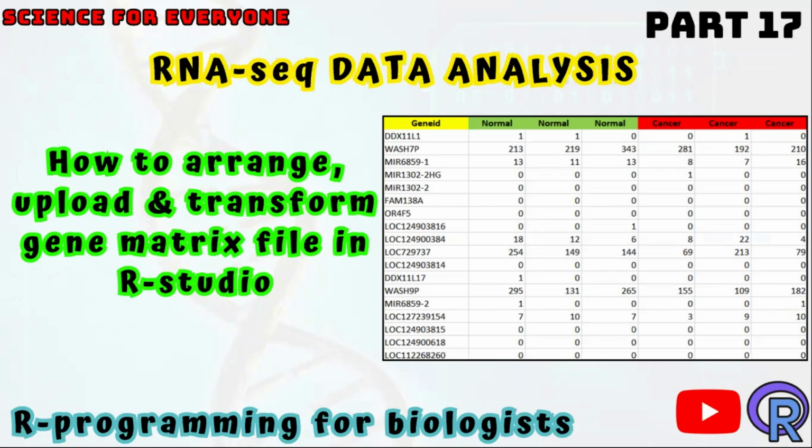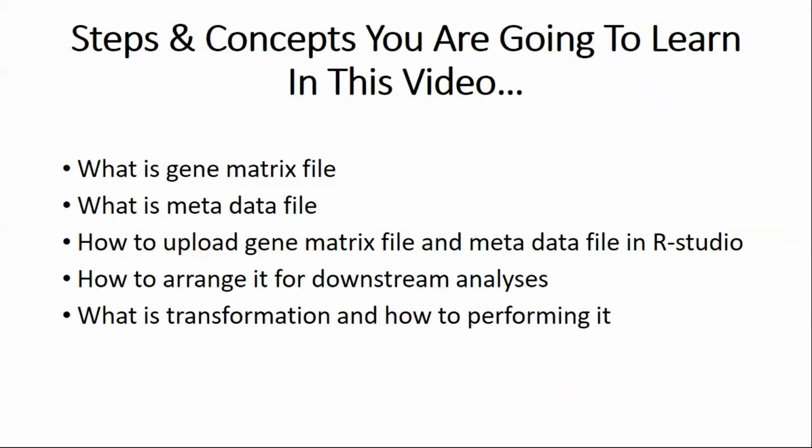Today the video is related to RNA sequencing data analysis, and the title of today's video is how to arrange, upload and transform gene matrix file in RStudio. Steps and concepts you are going to learn in this video are: what is a gene matrix file, what is a metadata file, how to upload gene matrix file and metadata file in RStudio, how to arrange it for downstream analysis, and what is transformation and how to perform it. So you are going to learn these concepts in today's video.